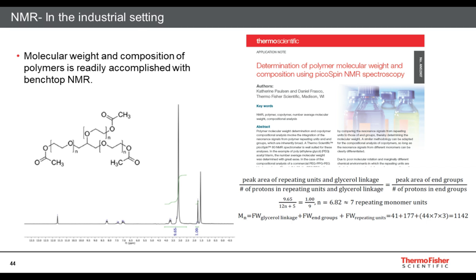And NMR is one of the preferred techniques, and it's related directly to the percent composition lab in terms of the mathematics being very similar. Again, we're kind of ignoring the multiplicity. We're ignoring individual resonances, and we're focusing on, well, here we've got one area we know is related to this, and another area we know is related to that.